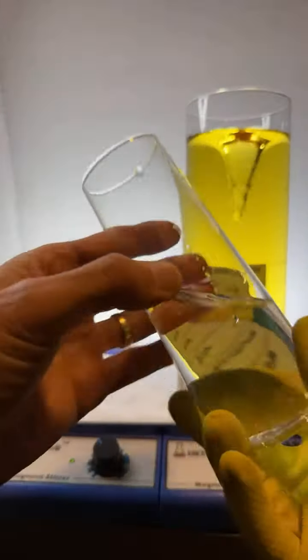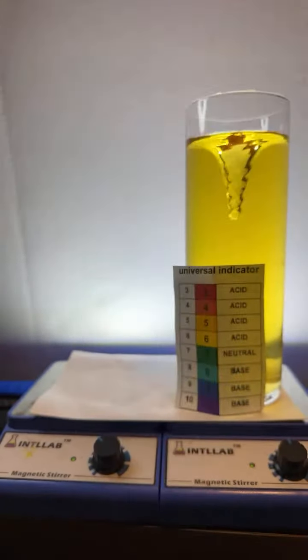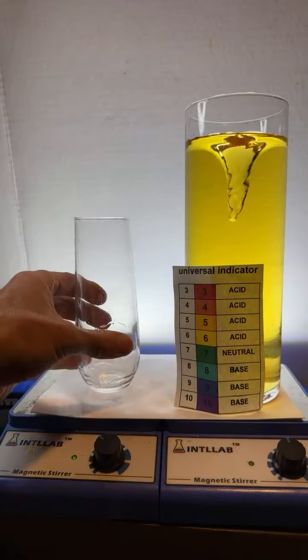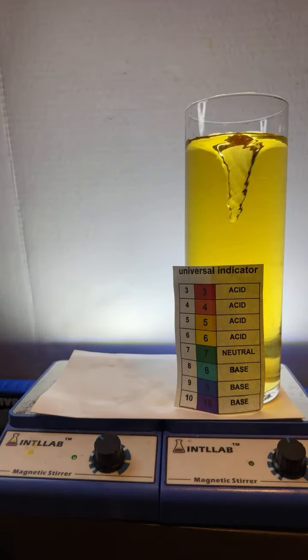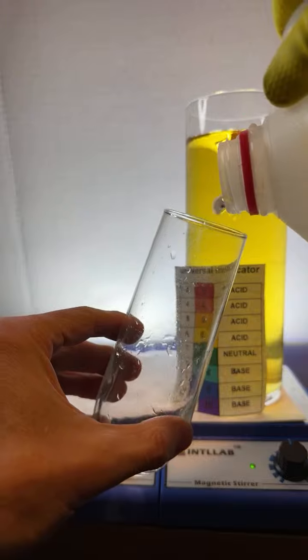You can see there's some gunk in there, so let's rinse that out with the distilled water. I probably should do it twice. There we go, I rinsed that out twice with distilled water, so we should be good to go. In goes the distilled water.